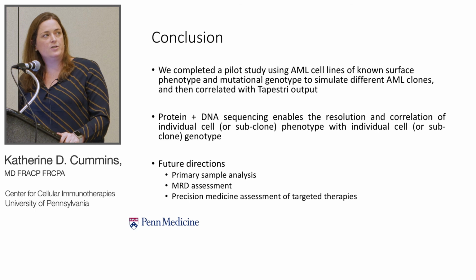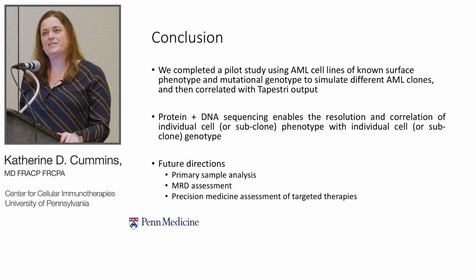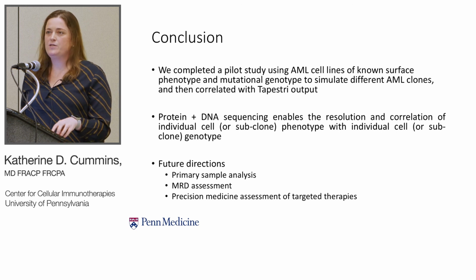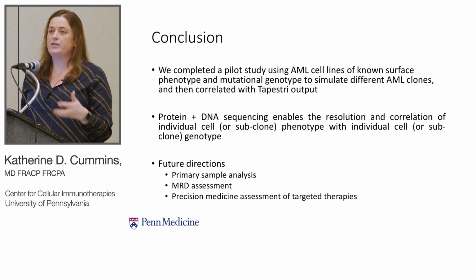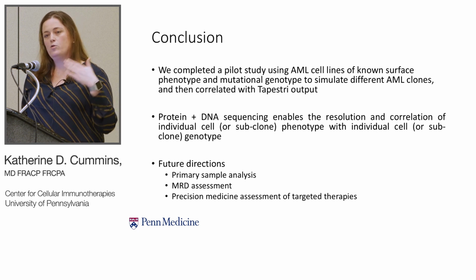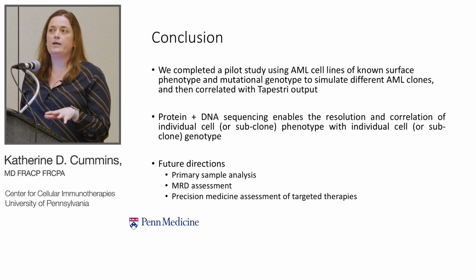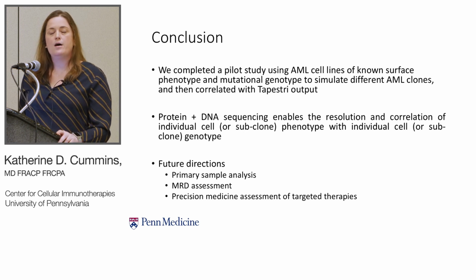Our future directions, which I think you'll hear some about from our next speaker, is looking at our primary cell analysis. Our focus in this first iteration, as I mentioned, is in the MRD framework and how we can really understand what status a patient's leukemia is in. But looking further down the field, it certainly has potential application in terms of precision medicine and having more tools available to treat patients with relapsed leukemia and deciding, based on this DNA and protein set of data, what is the best and optimal way, not only to monitor them, but to treat them.